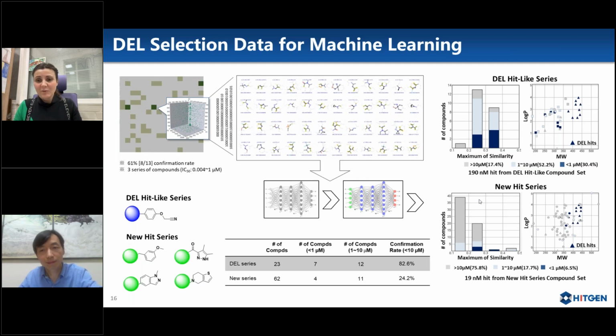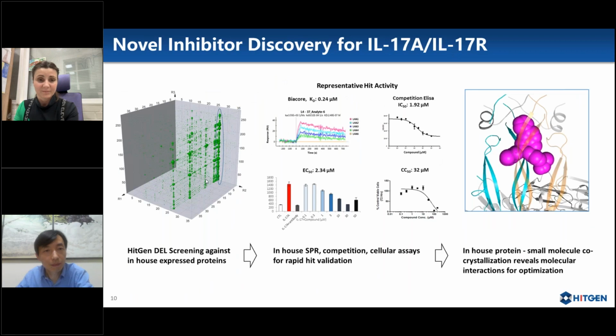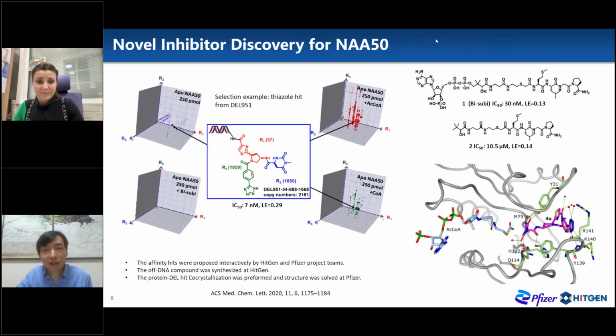Okay, thank you very much. It's clear now. And probably the last question before we close our webinar: the DEL data is noisy. How do you post-process the screening results to identify the hit compounds? Yeah, so let's show the slides here. This is just one of the very normal selection condition setups.